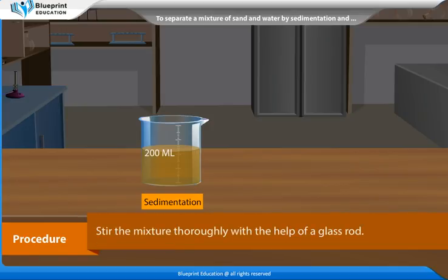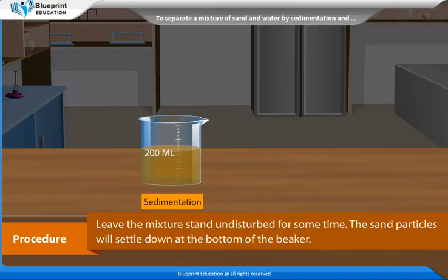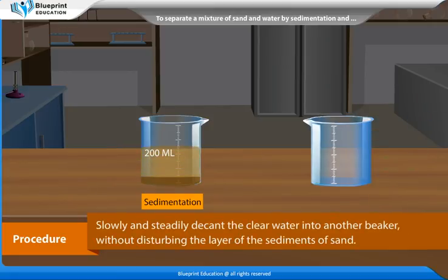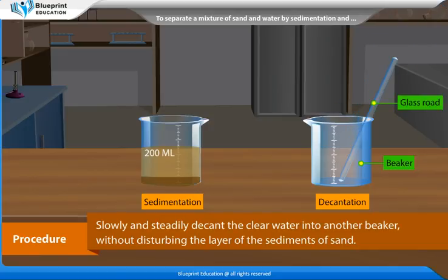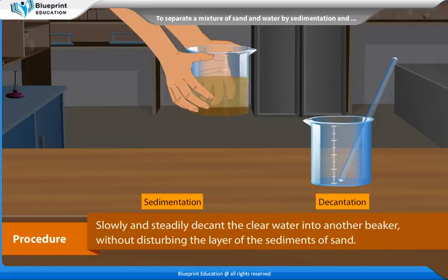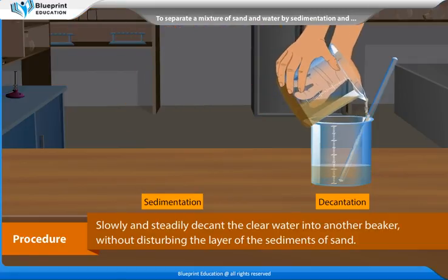Stir the mixture thoroughly with the help of a glass rod. Leave the mixture to stand undisturbed for some time. The sand particles will settle down at the bottom of the beaker. Slowly and steadily decant the clear water into another beaker, without disturbing the layer of the sediments of sand.